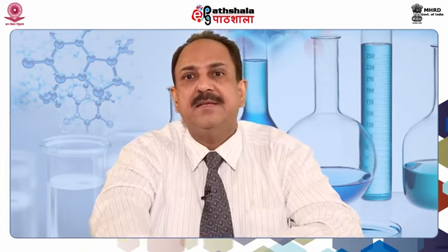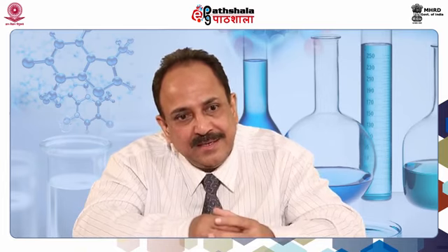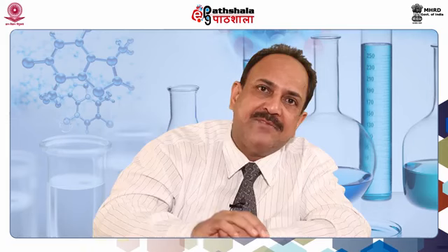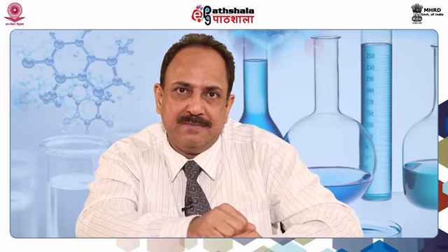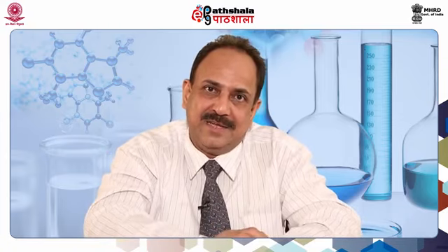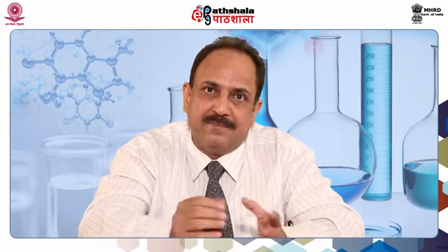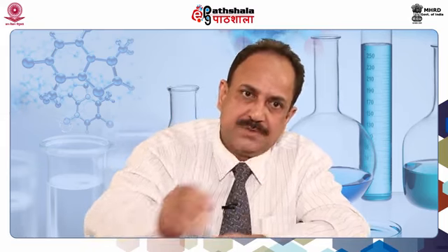After detecting the active site, we can enhance the graphics so as to see the complete molecule in the ribbon form showing secondary structures, and display the residues in the active site as solid sticks, and color the residues which are involved in binding and catalysis according to the type of the residue. Acidic as red color, basic as blue color, polar as yellow color, and gray as hydrophobic residues.